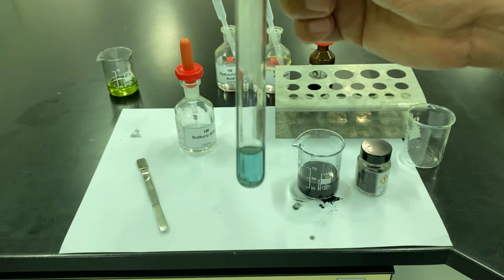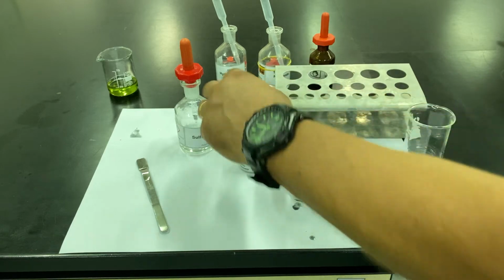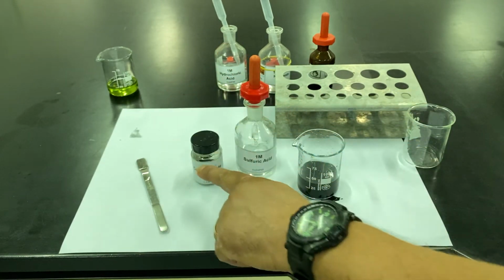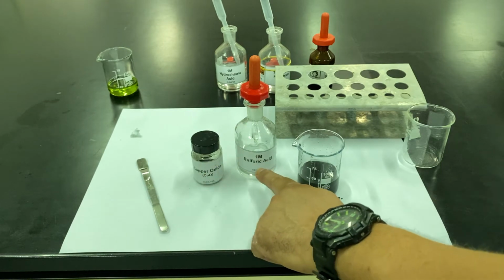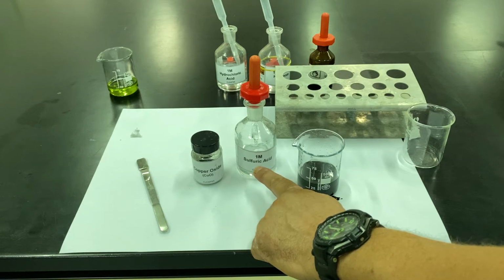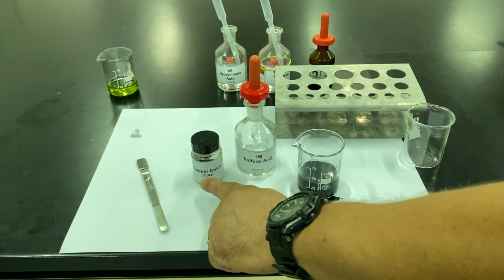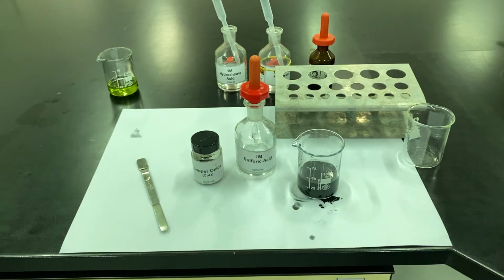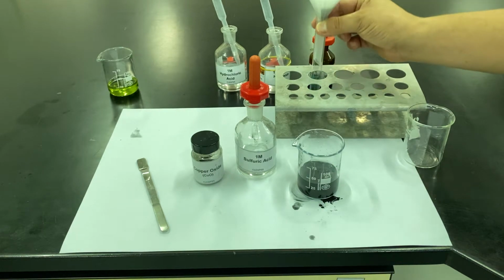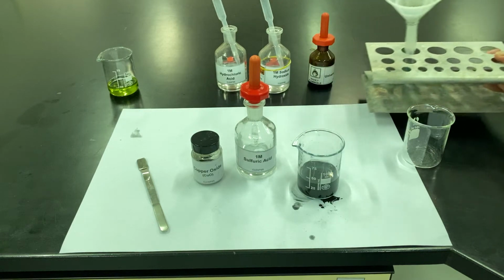Now this blue solution is, so see if we can guess. We've got copper oxide and sulfuric acid. So as you know, sulfuric acid produces sulfates. So this blue solution is a solution of copper sulfate. Okay. Another neutralization reaction.